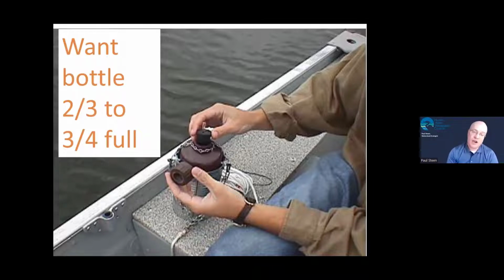So it might take a few tries as beginners until you get a sense of, for your lake and for your particular sampler, how fast or how slow you should be pulling this sampler up. Now, if the bottle is too empty, it probably means you pulled up too fast and you may not have enough water to do what we need to do. So that's why we suggest 2/3 to 3/4.